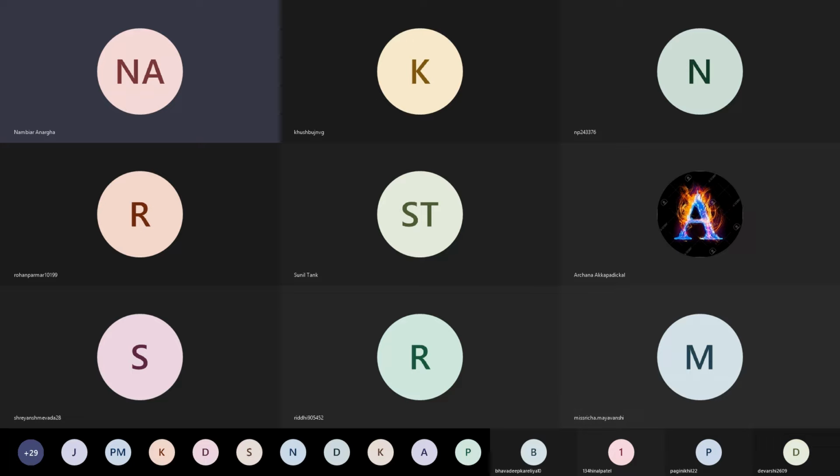So let us start with a video. In this video we are not showing rhodamine B and fluorescein, it is some other dyes, but you can see how the separation occurs. Because they are colored, you can see them and do not need any other standards, but still they use standards because that is an ideal way to know.